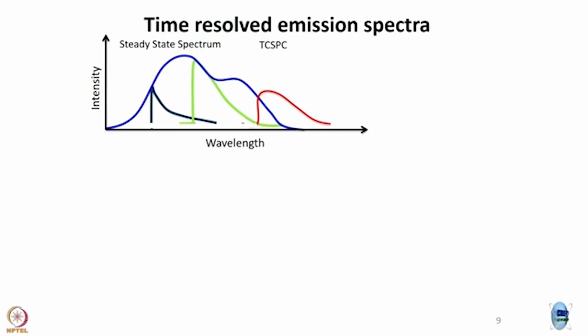If you are going to open the slit of your monochromator to say 20 nanometer, and then you are going to record decays in 1 nanometer intervals, it makes no sense. So, if you are going to record decays at 5 nanometer intervals, you should have a band pass of 2 nanometer, no more.